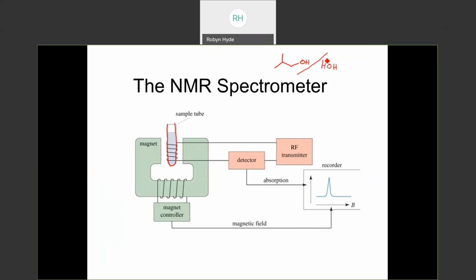Yeah, so I have 2 protons here that are also going to show up by proton NMR. I have protons in my solvent. It's really difficult if we have an unknown with all of these protons, and then a solvent with all of these protons, and their signals, their peaks, are going to be right on top of each other. So what we dissolve our samples into, we have to very carefully consider.